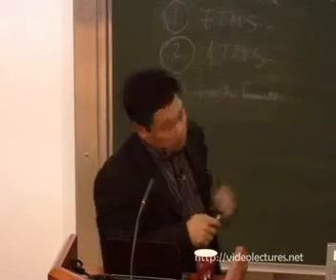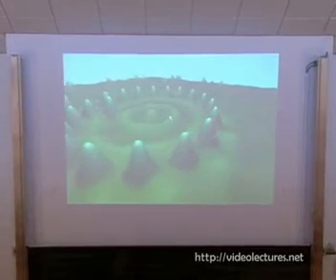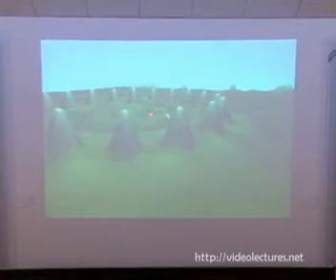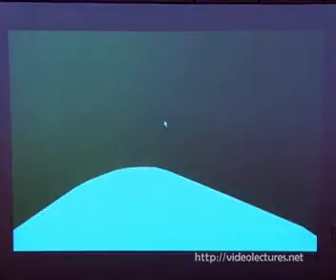Now let us look a little bit closer in 3 dimensions. So these are the atoms, and this is the atomic electronic wave, and this is how you will see it. These are the real STM images rendered in 3 dimensions. So these are the electron waves which will play important roles, and we can engineer them simply by locking them into different structures by putting the atoms. And you will notice the IJS logo, the recent logo, and also there are water-like things near the atoms.